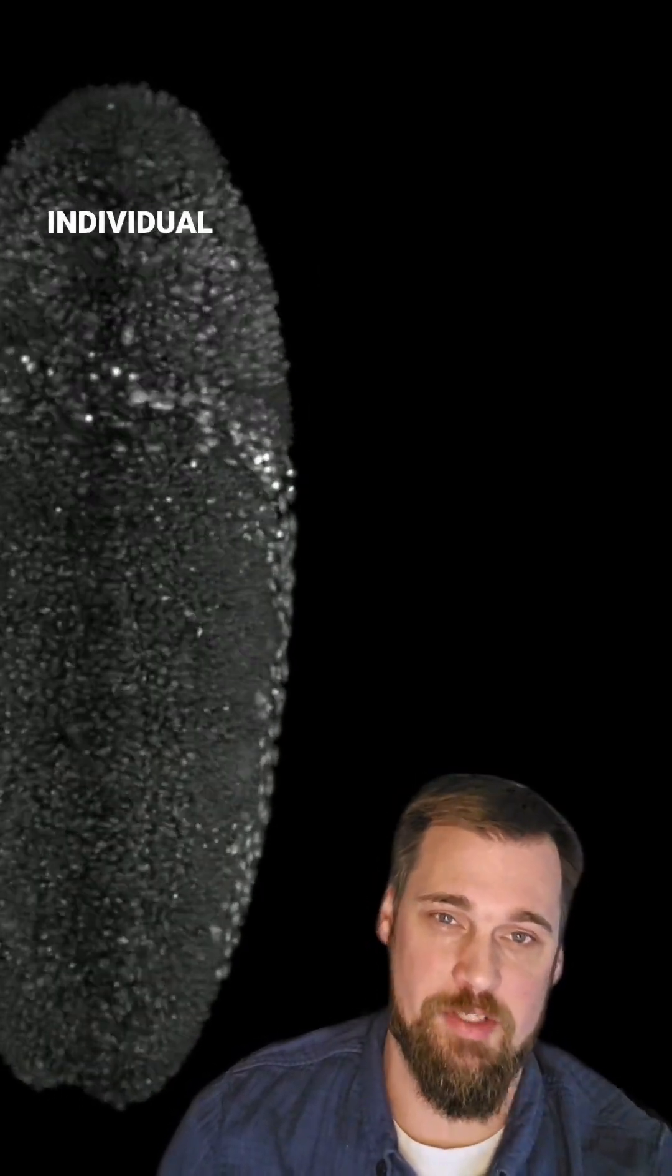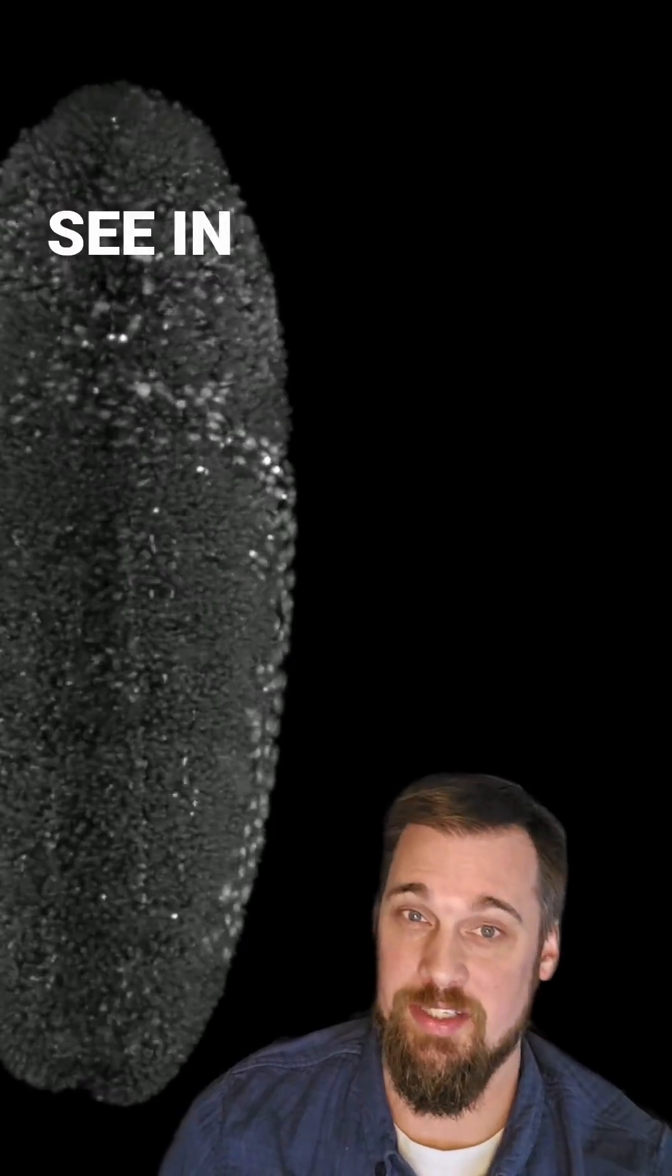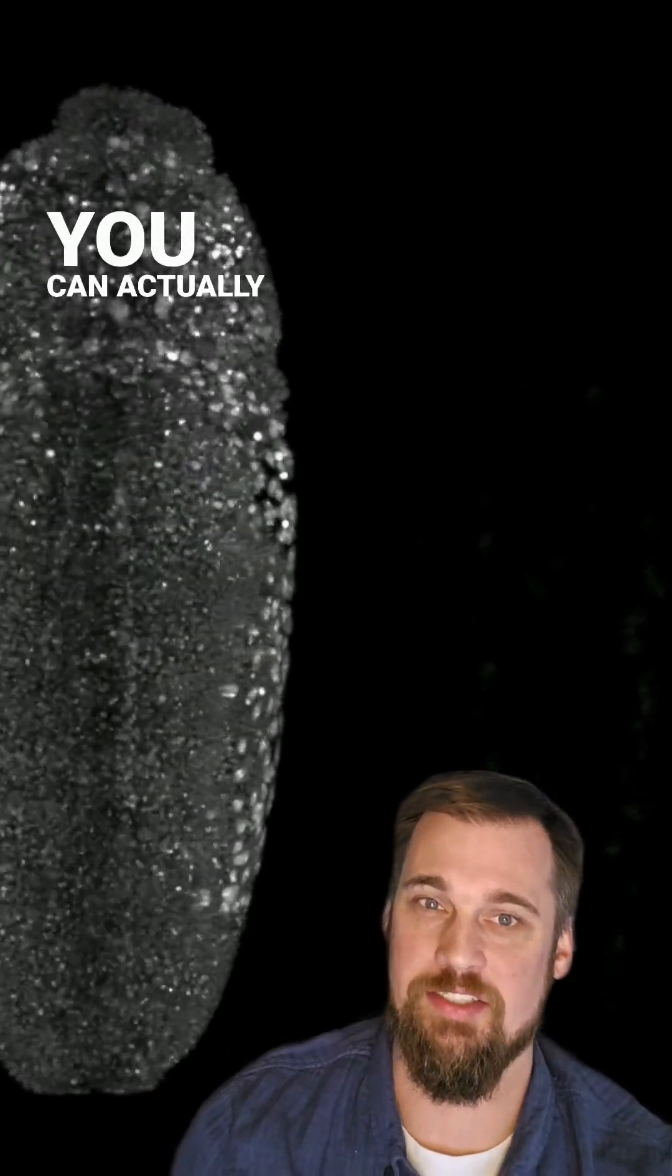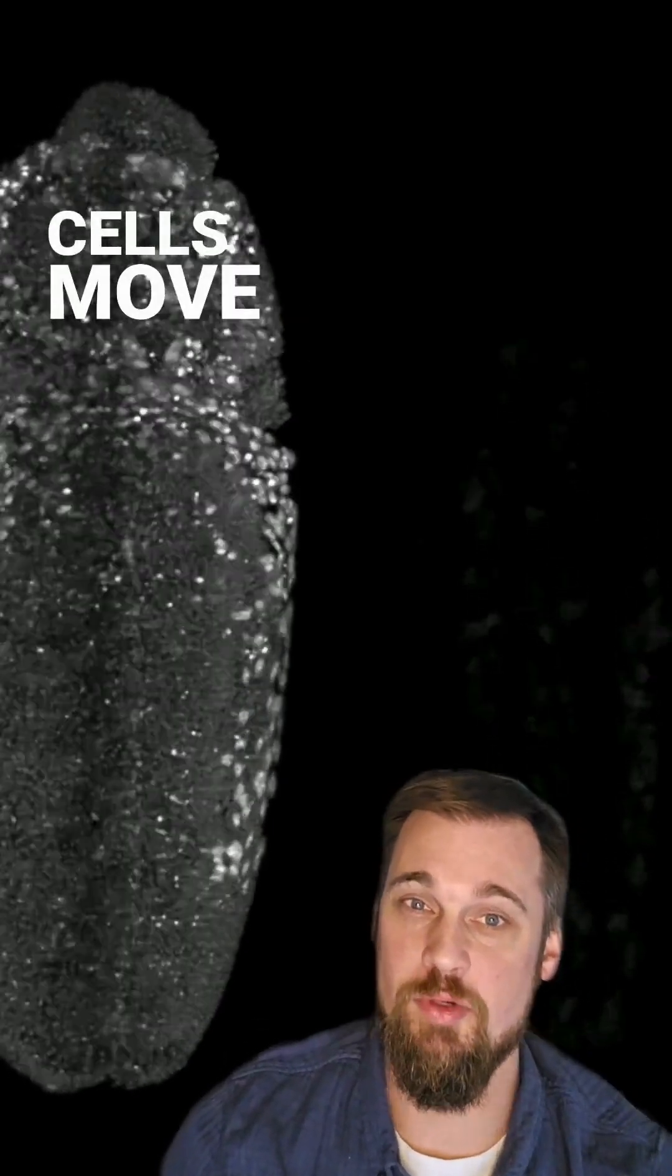Each one of the individual gray or white dots you see in that oval are individual cells in this developing embryo. And the cool part about this is you can actually watch as these cells move while the organism develops.